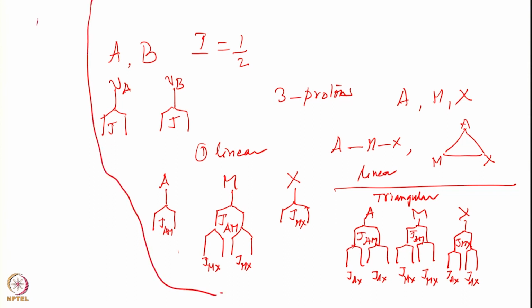For 2 spins I will write alpha beta, alpha alpha, beta alpha, beta beta, these are the states, and then I will have this energy axis, and draw the transitions like this, like this, like this. There are 4 transitions possible, for example alpha alpha to beta alpha, and we label them as 4 different transitions.